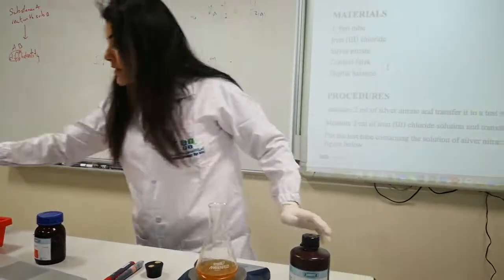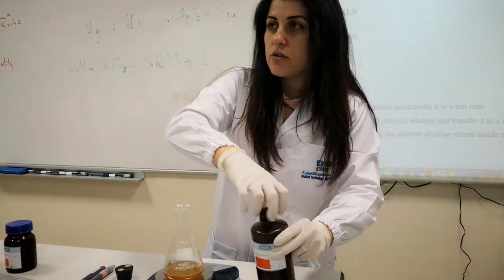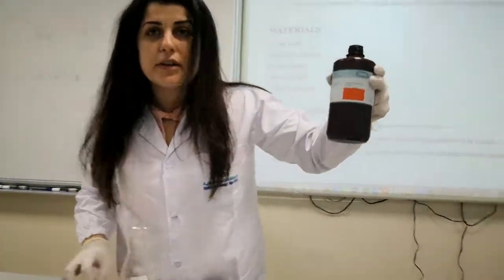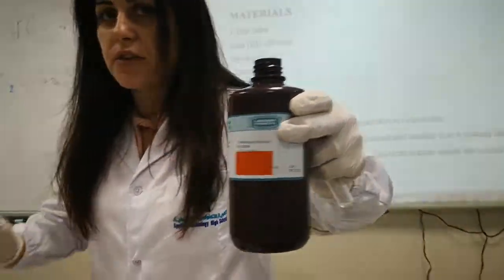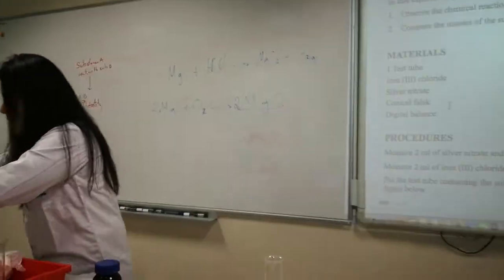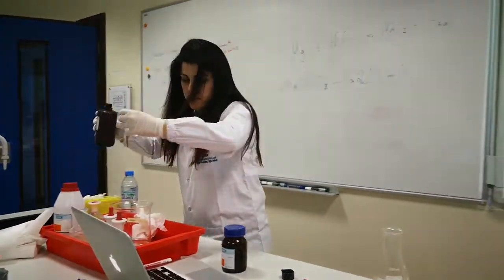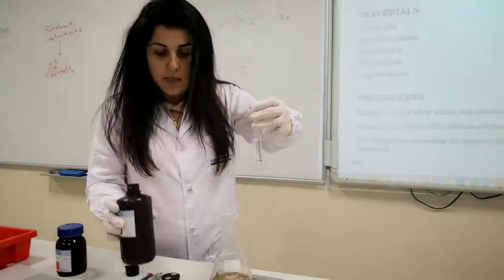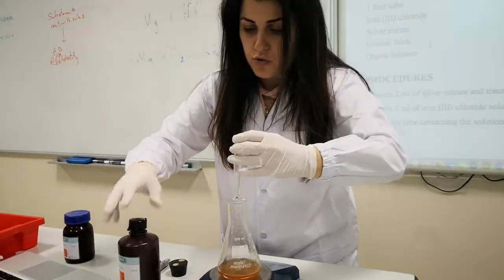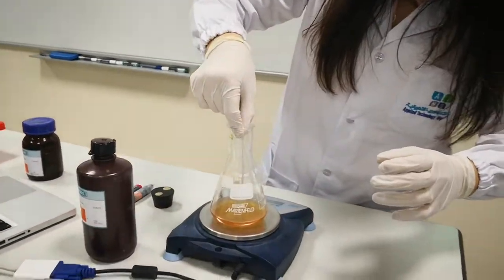In another test tube, we are going to add a solution of silver nitrate. This silver nitrate solution will then be dropped into the flask.